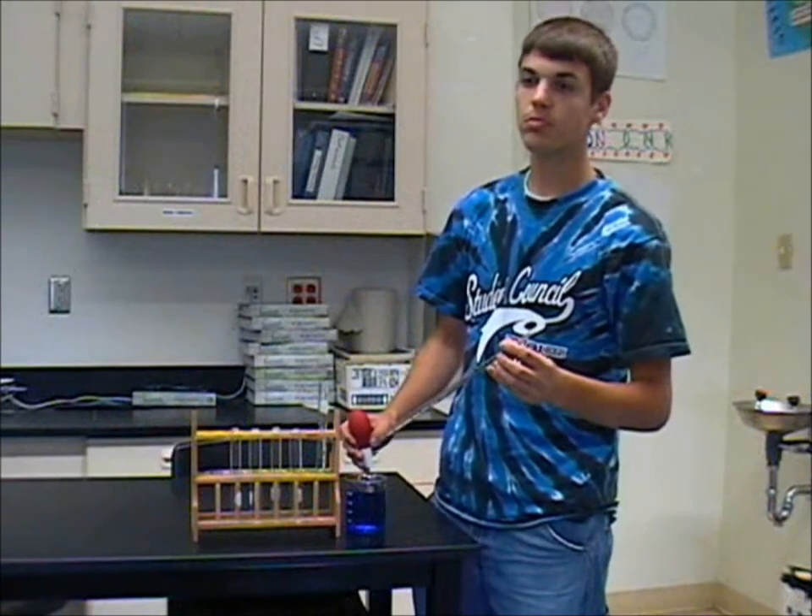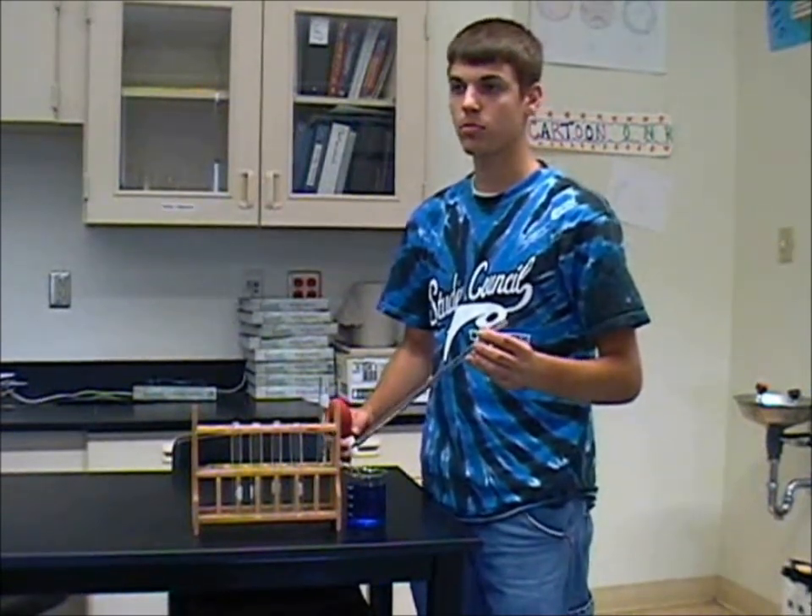For measuring and transferring a solution into a test tube, we often use an instrument called a pipette and a pipette bulb.